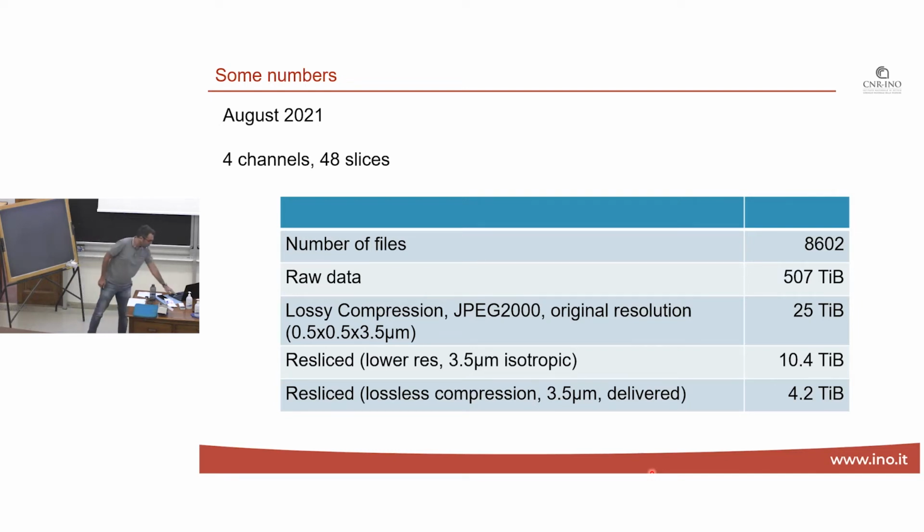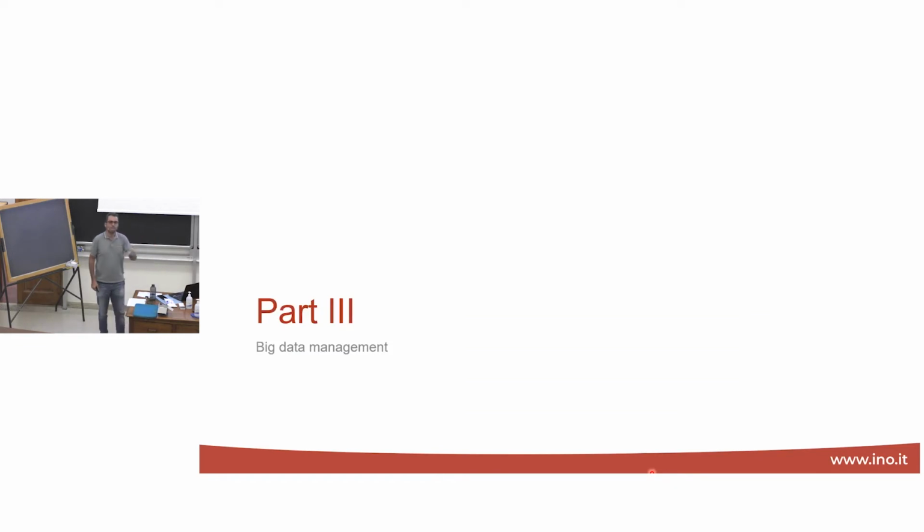Anyways, and now let's finally move to the big data management part. I will show you some challenges that arise in dealing with this kind of data sets, and also some application of artificial neural networks for automatic cell segmentation, cell counting, and things like that.